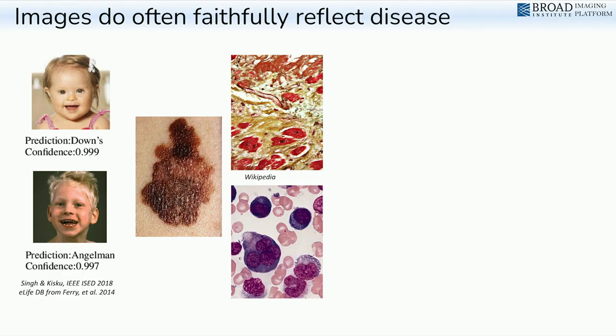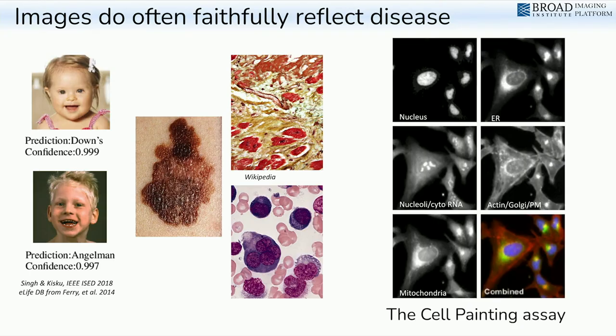And so we're just really taking that concept, but we're doing everything in a very constrained, nice in vitro cell model where we can infinitely perturb cells with drugs and with genetic perturbations to try to figure out what is going on with those different disease-related phenotypes.